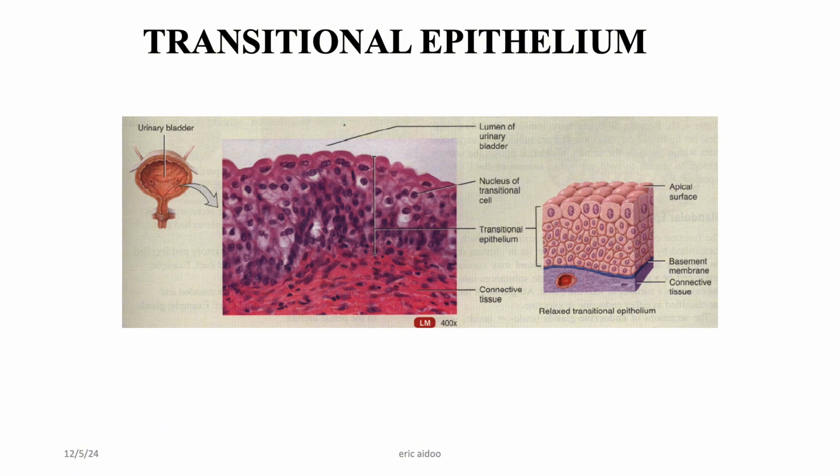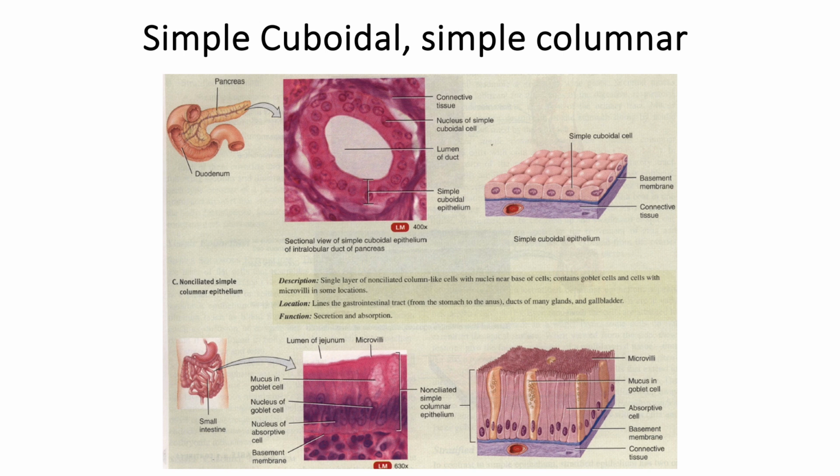This is another example of transitional epithelium, and you can see the bladder has been shown and then projected here to elaborate on how the lining epithelium looks. For the transitional epithelium, you can always see only one aspect of the shape at a time, because this is not a dynamic picture, it's not a motion picture or a movie, it's just a static picture. So at every point when the picture is taken for transitional epithelium, you're only going to see a particular shape.